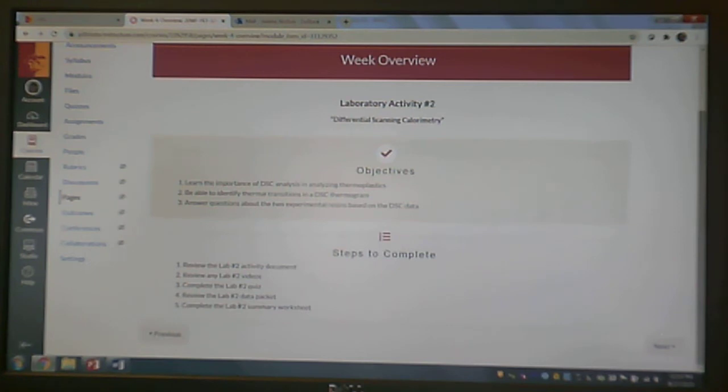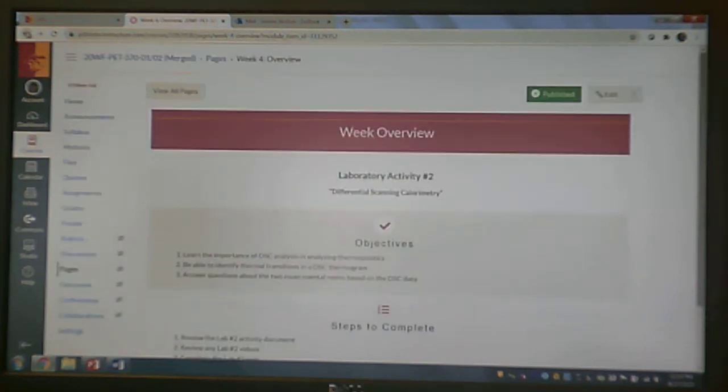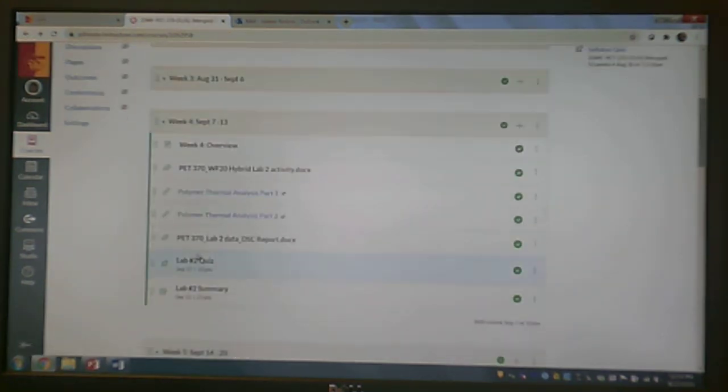This is the first lab in which we have a data packet, so I will show you that as we go through this summary. There's a couple of different videos here. The first one gives some background on polymer thermal analysis, and then the second part actually talks about DSC. So please watch both of these videos. When we do TGA, TGA is in the second video, so there won't be the first video. But please watch both parts 1 and 2 through the DSC information.